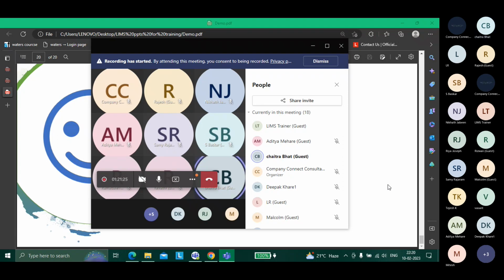See, when you read any SOP, you cannot just tell I have become a master in it. When I read the lot management SOP, it just says when I click this, this happens. But I create lots based on certain templates. I need to know what those lot templates are. Why something is written in blue, why some fields are black? That's when I'll be able to join the dots. And learning that is mostly not a one day task, or creating that template is not a 1 hour task. No, never. You need to know how to set each flag, what each flag does. Then only you need to learn, study.